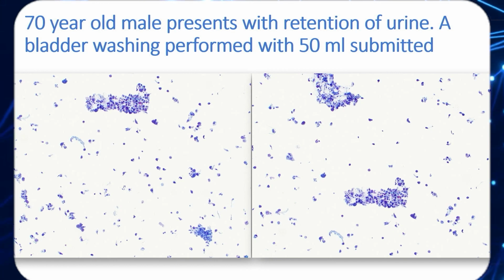There are two fields over here, really adjacent to here, illustrating that there are groups of cells, not quite well adherent, but kind of clustering together. But in the background, there are single cells. They certainly appear to have a high NC ratio. And on a busy day, urine number 51, I think I'm good for making an outright call, right?